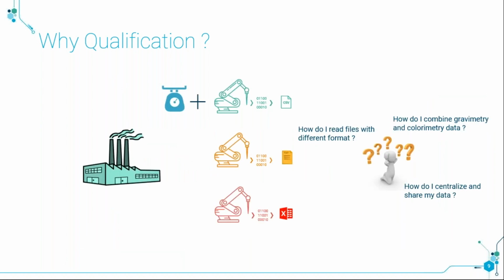The other question is, let's say that we are all working in a lab for a company, obviously a green company these days. In our lab, we have a lot of different devices: balances, readers, liquid handlers.